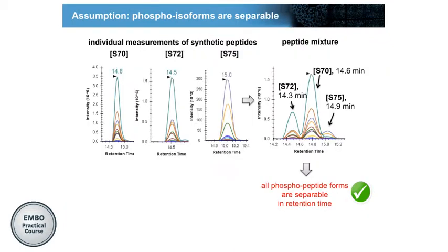So we always need to remember this issue of retention time, that might be an issue, and then we need to think about how we translate this from shotgun into SRM or SWATH. To make the case more pronounced, I'm going to be talking about SWATH data from Ludovic, and about this transition from a shotgun kind of approach to a SWATH kind of approach, when we're quantifying in shotgun and quantifying in SWATH, and what happens.